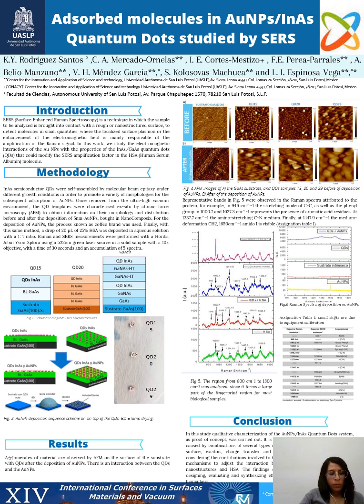For the deposition of the gold nanoparticles, the process known as drop casting was used. Finally, with the same method, a drop of HSA was deposited in aqueous solution with a 1:1 ratio.